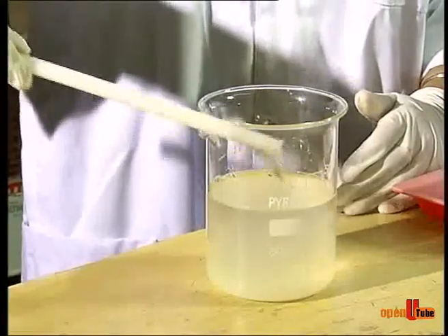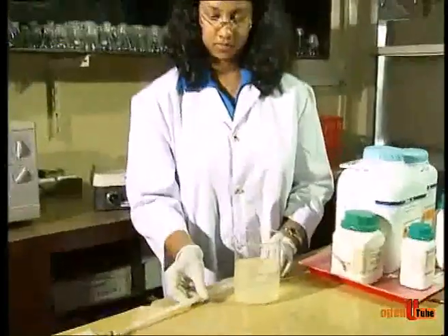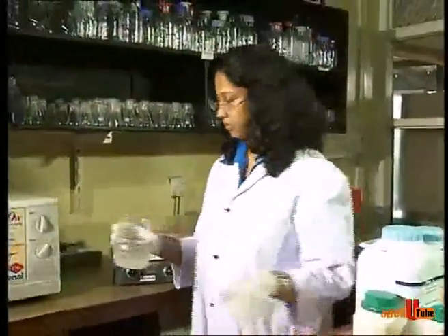If the agar in the MS solution is not dissolved properly, you can use a microwave to dissolve it.